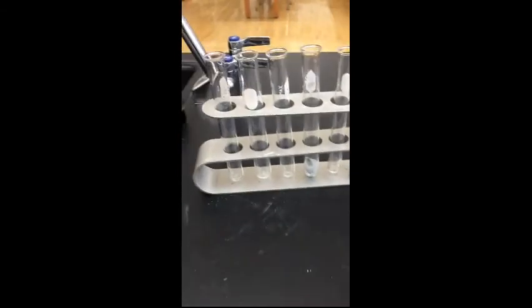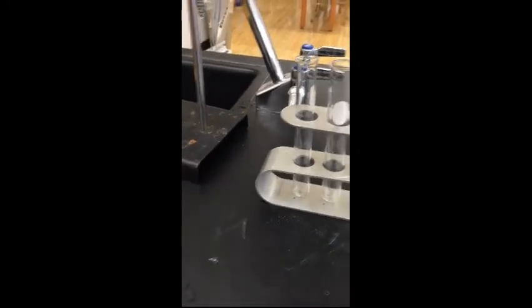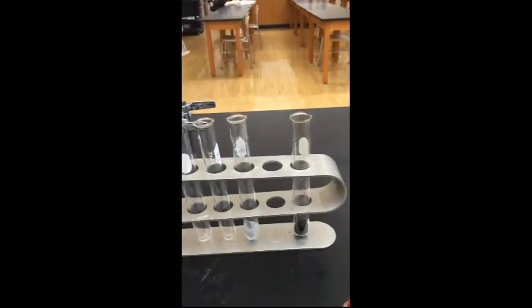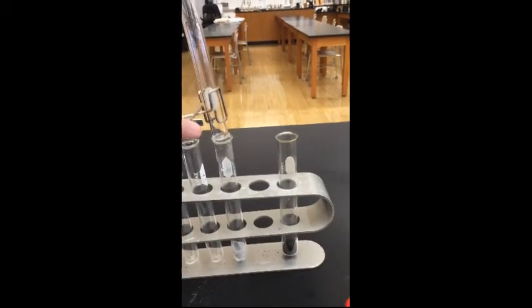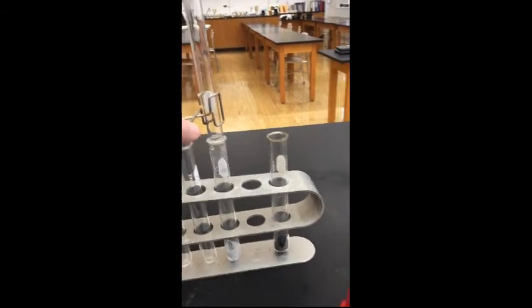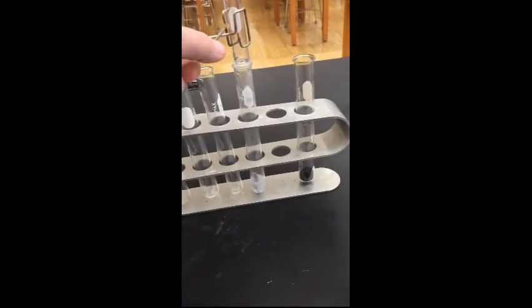I'm going to take another test tube. I'm going to put it over the top. You can see there's some smoke coming out of that. I'm going to put it over the top of this for about 30 seconds or so. You can still see it's fizzing pretty well.